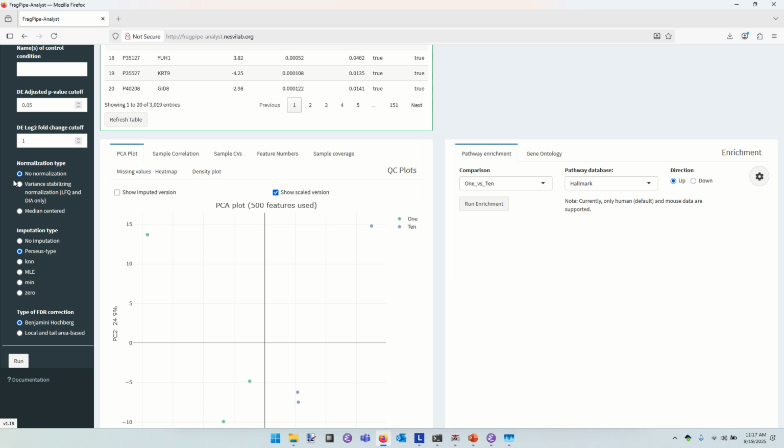But when you do have to perform data normalization, do you have a certain method that you prefer, or it varies per experiment? In this case, we have three options. I prefer massaging the data the least necessary, so the default of no normalization is already where I would leave things. Okay. But if I knew that the instrument had very variable responses across the experiments, I wouldn't have an alternative to using normalization. Yeah.